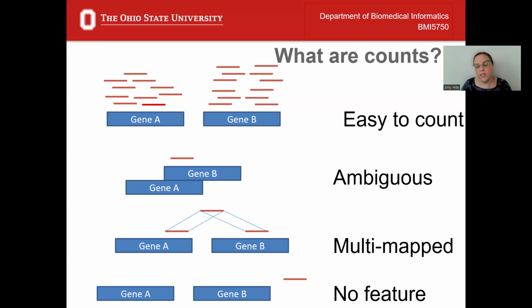And even though it's covered up here by this hide meeting controls, even though we assume that we are sequencing the RNA in a sample, and this would be only the official gene regions, there could be times when a read maps completely outside of gene regions. And this could be a bad alignment. It could be a false alignment. It could also be some gene that we don't know about yet.